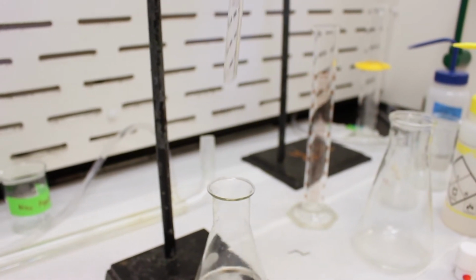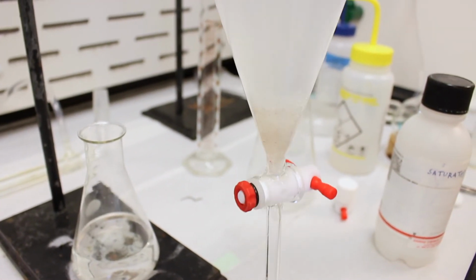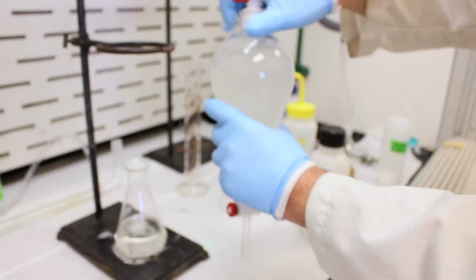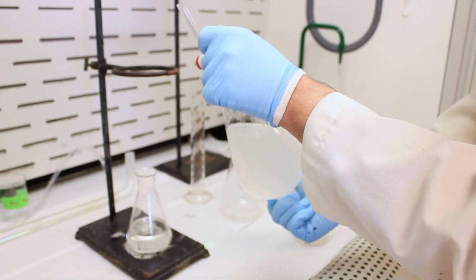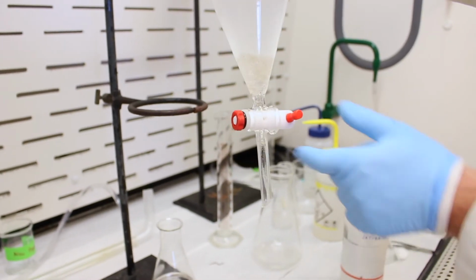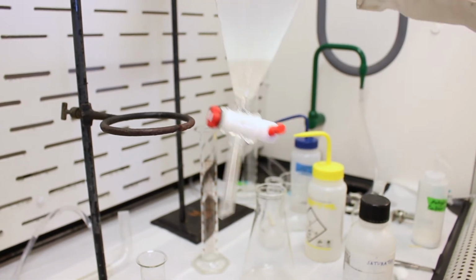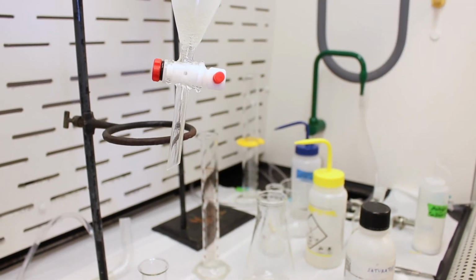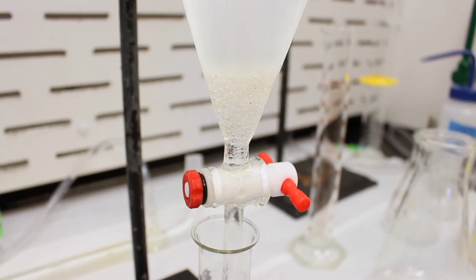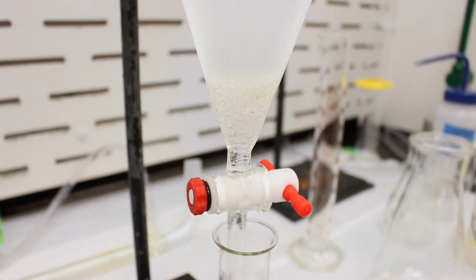We can try to maybe swirl it just a little bit more. Maybe it might resolve, it might not. I will try to invert it. Maybe that will resolve it. There we go. So I think we got, oh, there's some bubbles. Try again. Perhaps I'll try the pipette trick one more time. If it doesn't work, that's okay. We've got the majority of the eugenol out of there.